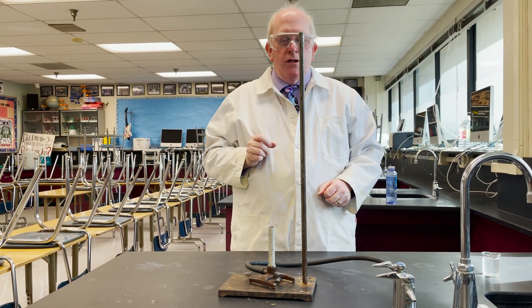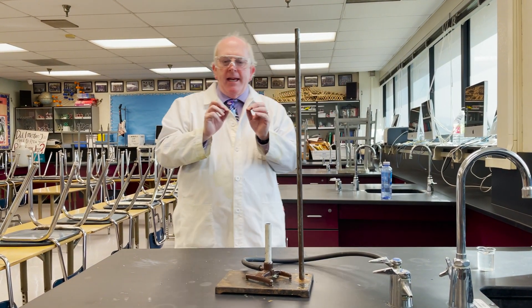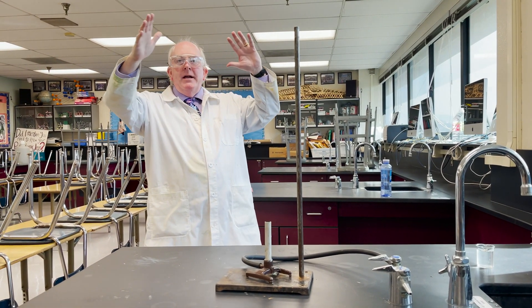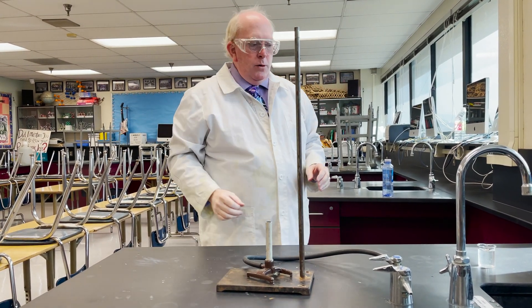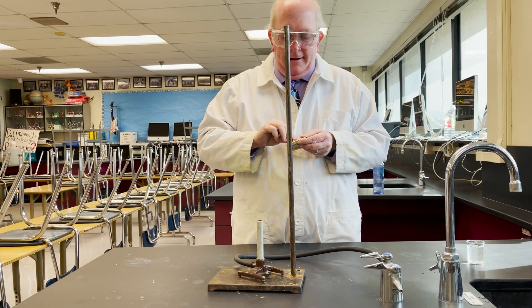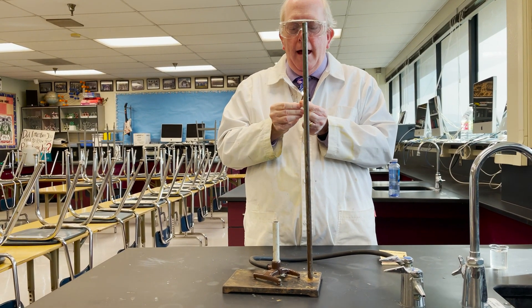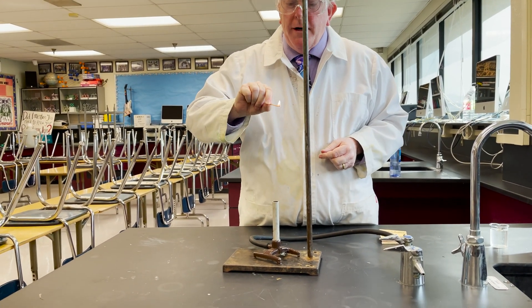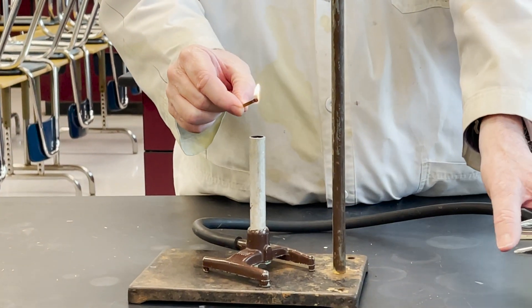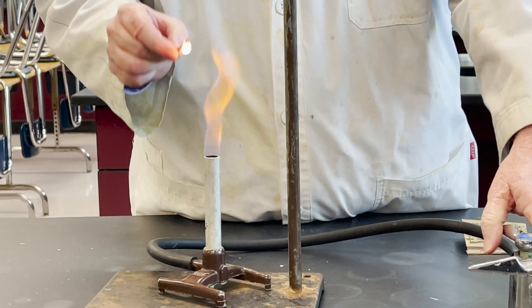One student to light a Bunsen burner. If you turn the gas on and get somebody else standing back here throwing matches from 10 feet away, you're going to get a big fireball — that's not cool. Take your match, light it, get it burning good, close your vent, hold that over the Bunsen burner, and turn on the gas with your other hand.